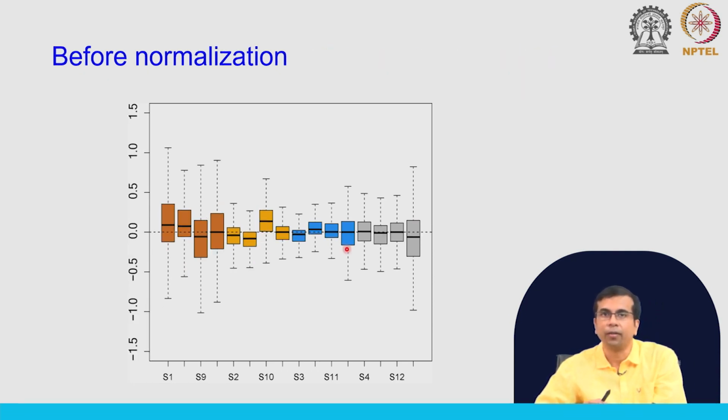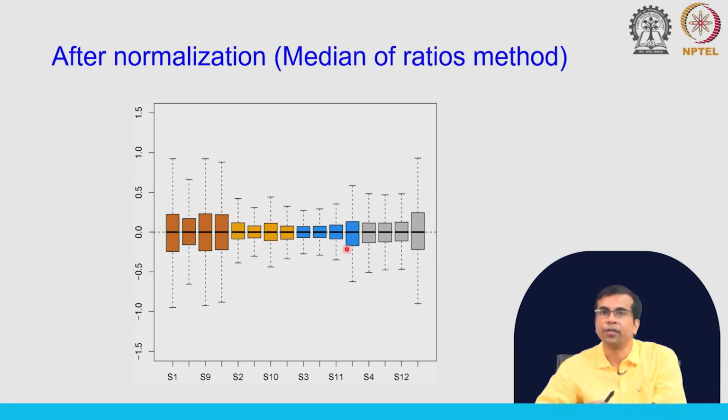These are the raw data distributions, and after this normalization you get this kind of distribution for each sample. As you can probably guess, the RLE plot is related to the term RLE, relative log expression. When you make this plot, you follow the same procedure: you calculate the geometric mean and then divide by it, you get the normalization factors and then you get these plots. That is why they are centered around 0.